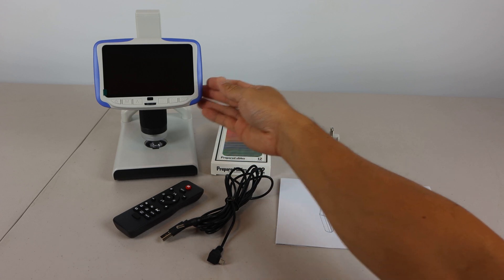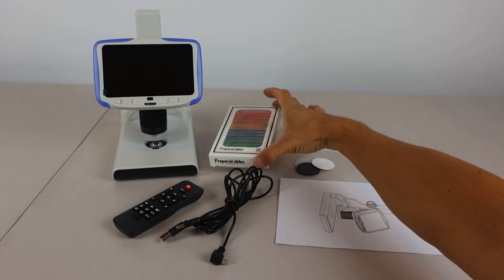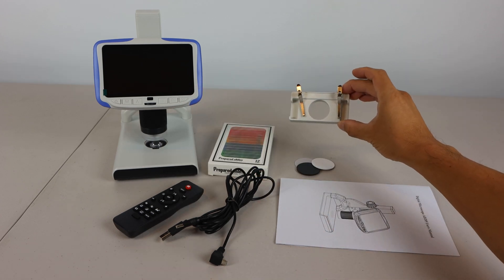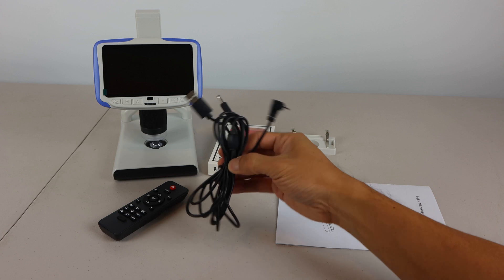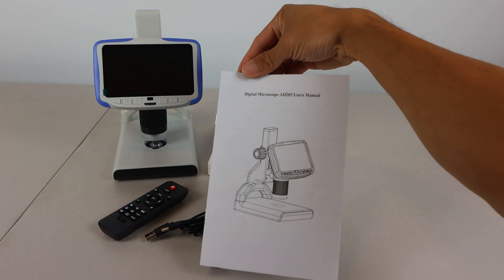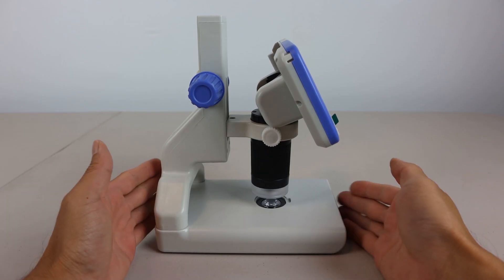You'll receive the microscope, a set of 12 prepared slides, stage clip block, three light filters (white, black, and translucent), a remote control, USB power cord with dual connectors, and an instruction manual.